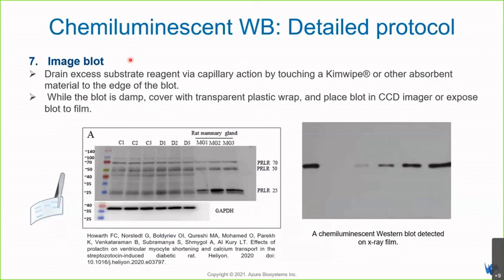So finally, we do the imaging step. Drain off the excess substrate reagent by capillary action. You can do it by touching a Kimwipe or other absorbent material to the edge of the blot and remove the excess substrate. While the blot is damp, it has to be wet all the time. It should not be dry.